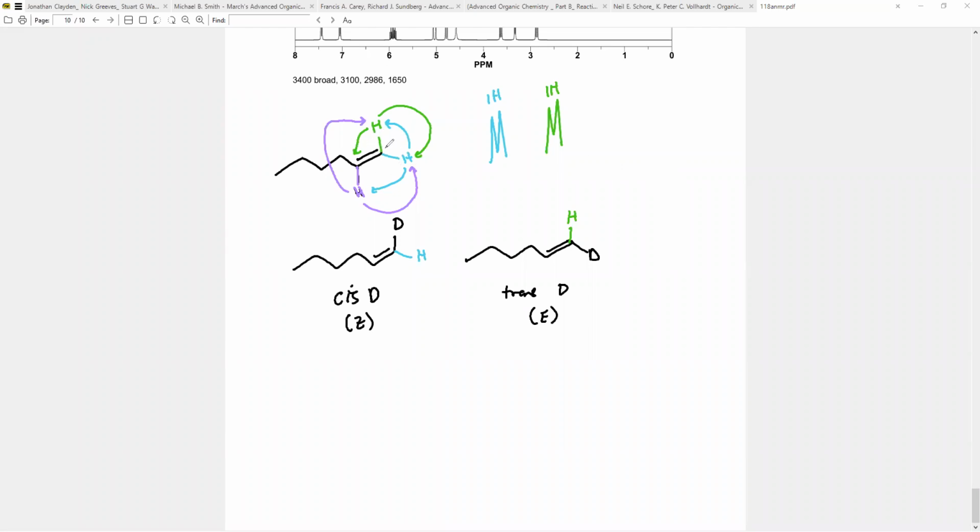different talking rates, and again, how they split is going to be a little bit different. But this guy also talks to these guys over here. So we also have conversation going on over here. And so this is where that little trick came in that I told you guys about. Okay, because this hydrogen here, obviously, is different from these guys.